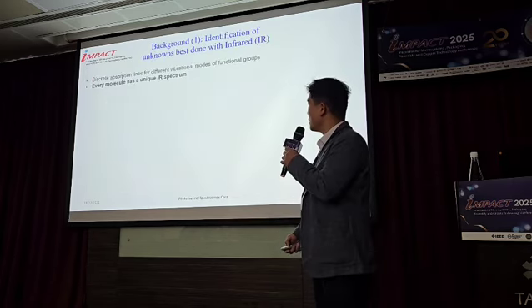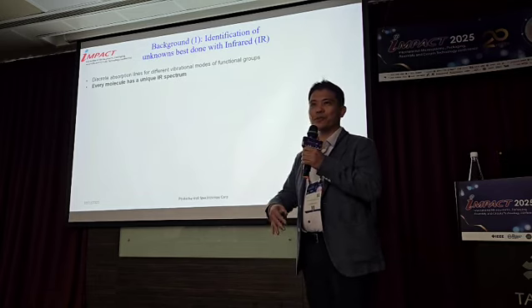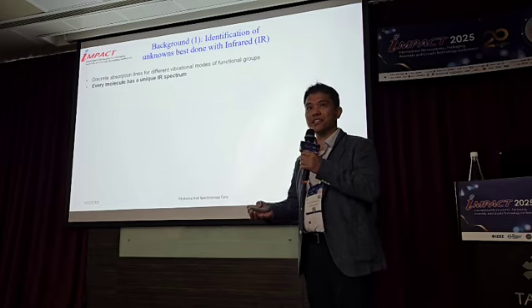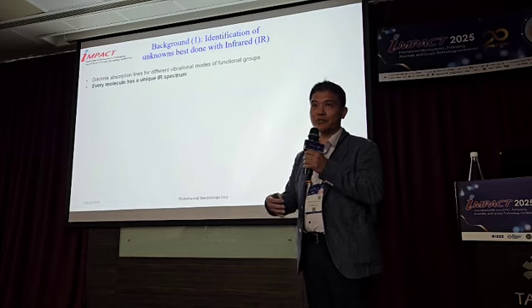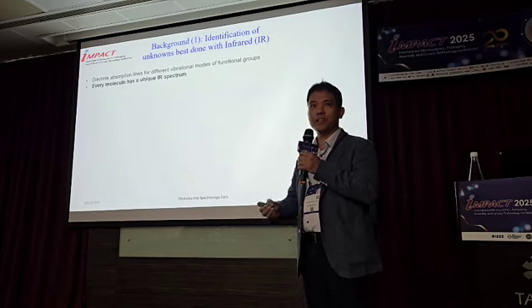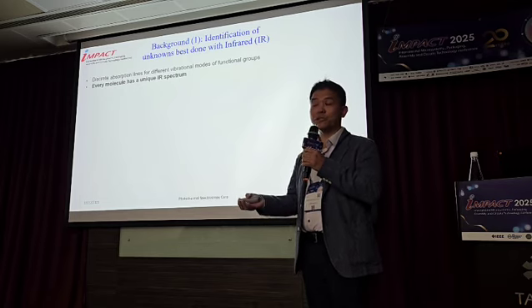All right, it goes back to the basics, where we have, let's say, molecules. For us to identify what it is, we go back to using infrared, because infrared spectroscopy gives us the functional groups and the connectivity between the atoms that SEM couldn't.